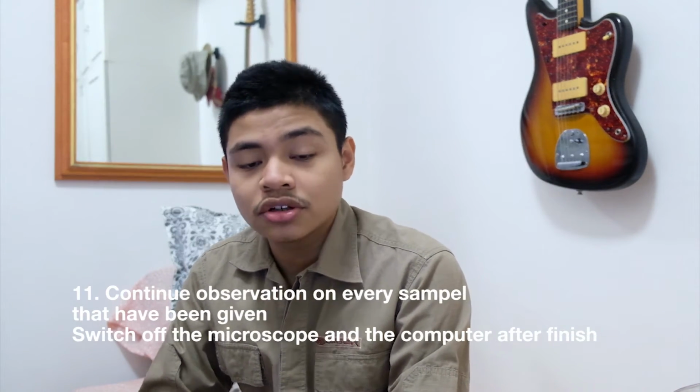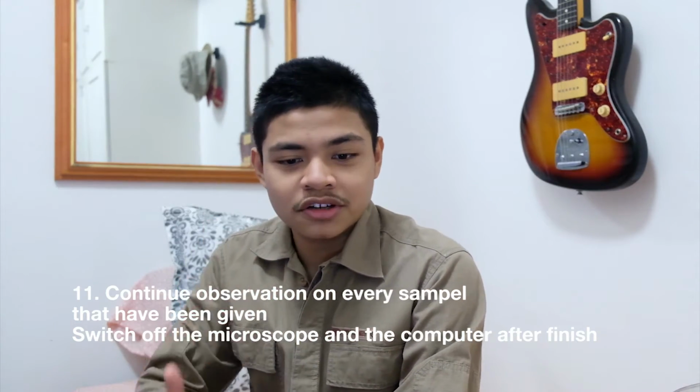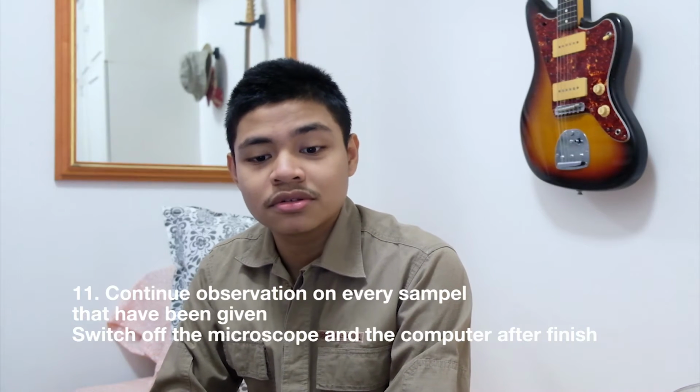And the last step is continue observation on every sample that has been given. And don't you forget to switch off the microscope and computer after you finish the experiment.